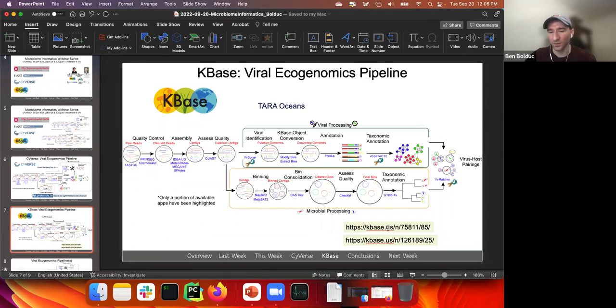One is an older one that's about 6 months old, and absolutely everything has been processed in it, but it hasn't gone through the entire new version. For example, this version uses the old VirSorter, and the new one uses the new VirSorter. The old one didn't have CheckV, the new one has CheckV.